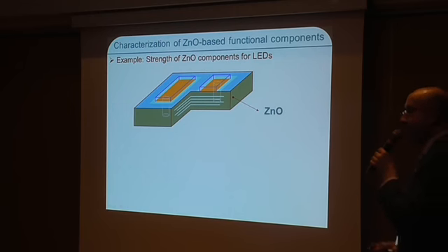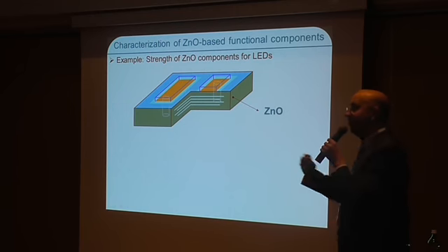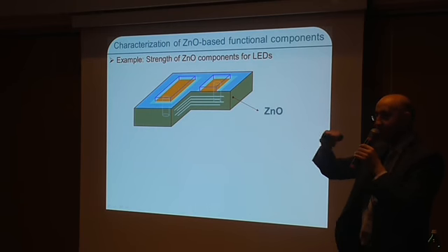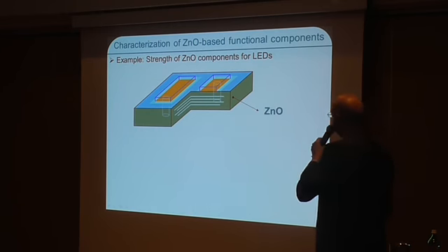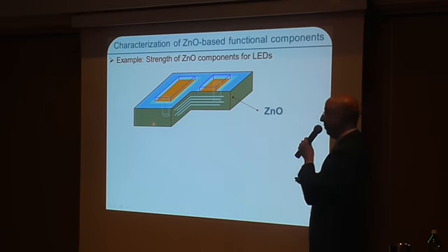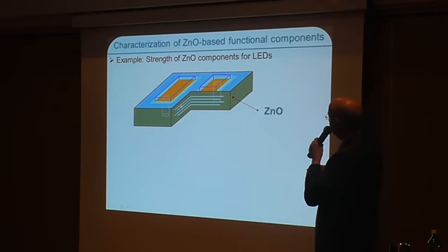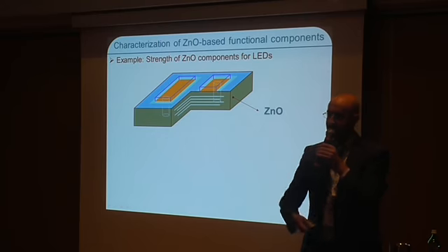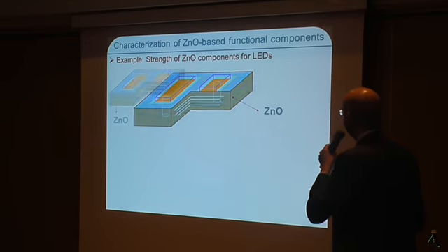Now we have the testing method, we are aware of different effects, and we get to the real samples. Real components are much more complex in their structure than just one single ceramic with a top layer of metals. This is one example where you have zinc oxide as a substrate material, with metallizations inside, vias going through the material, top metallizations, glasses to isolate, and everything.